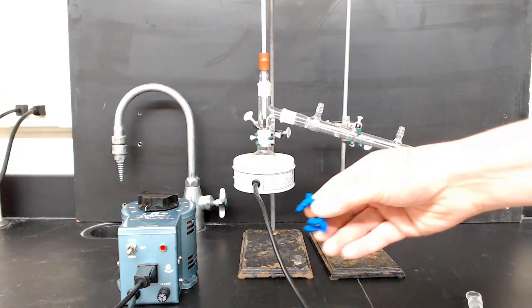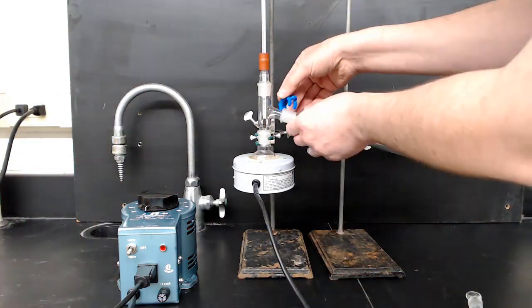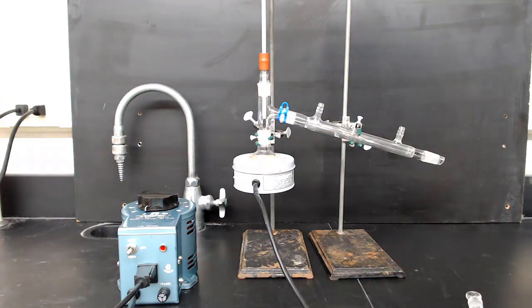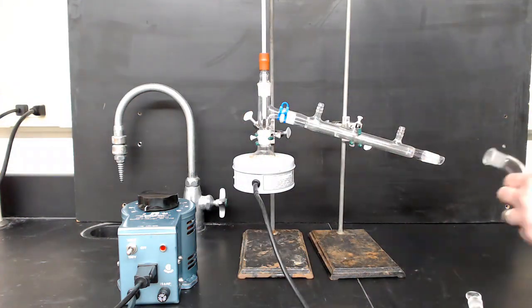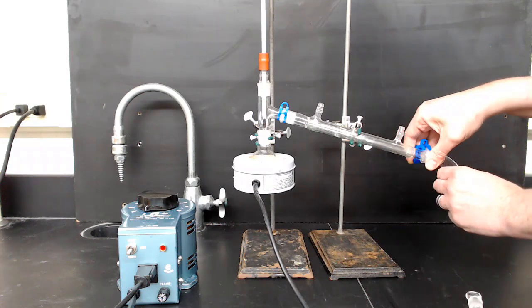Then secure with one of these blue Keck clamps. Next, get a vacuum adapter, which looks like this, and secure that to the end of the condenser, again using a Keck clamp.